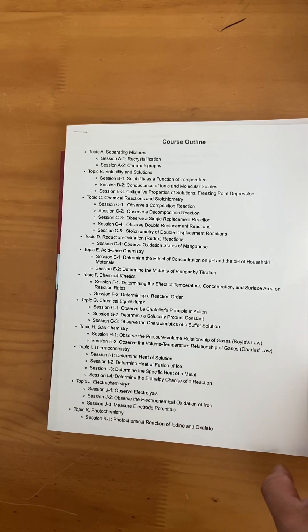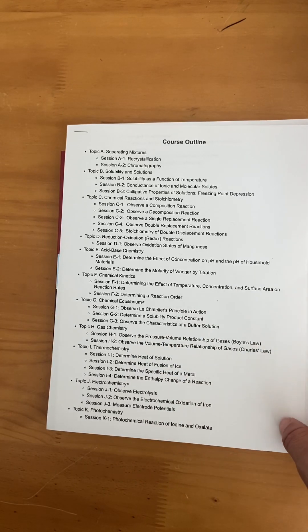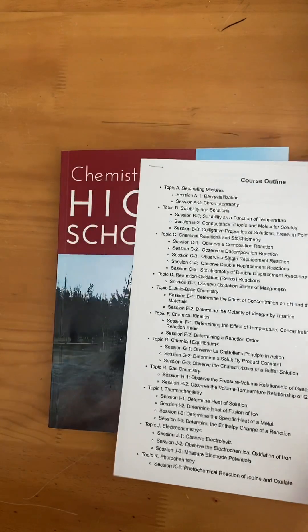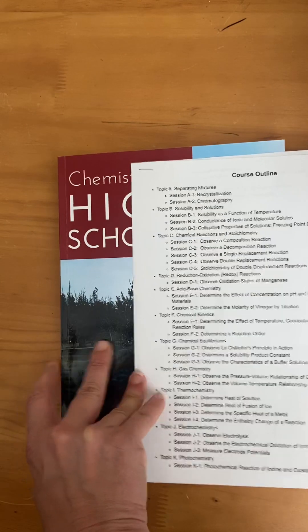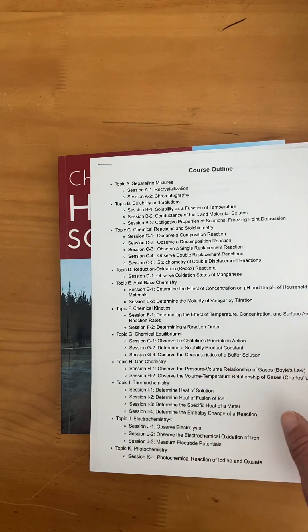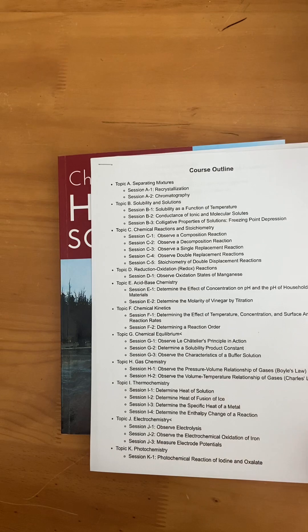If you aren't interested in doing these labs yourself or having your child do them, there is a free lab demonstration channel on YouTube. I believe it's called Beyond Labs, and there are links on the Elemental Science overview page. You can watch the demonstrations so you don't have to do the actual labs yourself, but for us it's important to actually do them, which is why we ordered this kit.